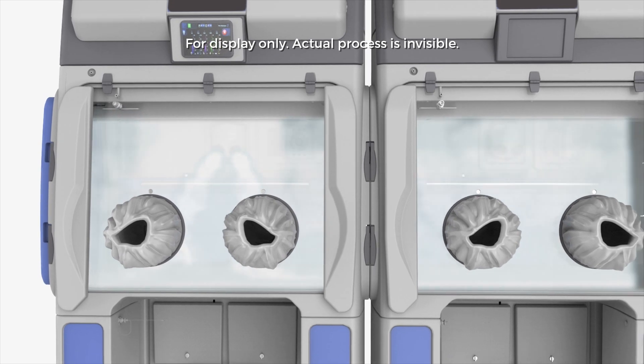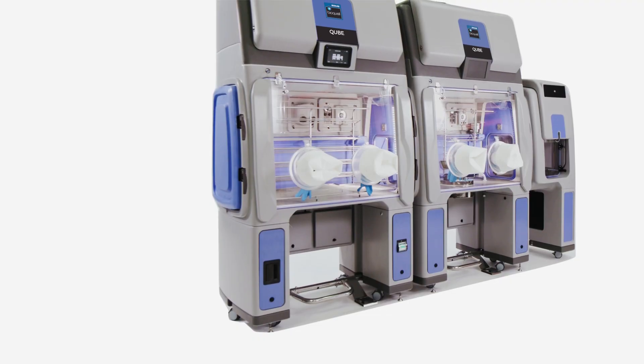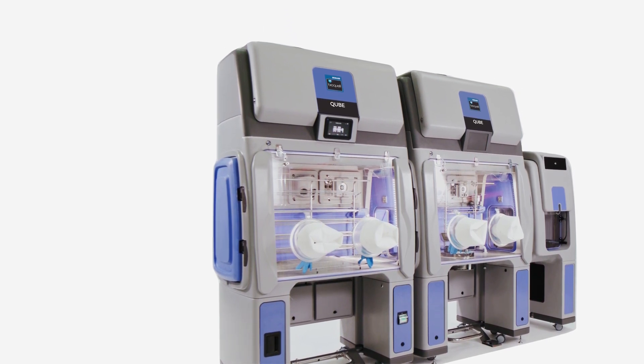It can retain an aseptic hold for at least seven days. While it creates a Grade A ISO 5 equivalent workspace in the isolator, the system can reside in a lower grade clean room, saving gowning time and operating costs.